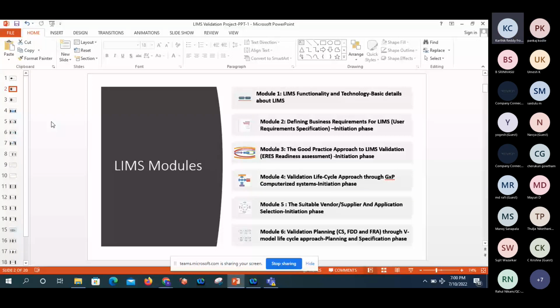A test protocol contains test scripts. In the test script, we state the steps, whatever the patches are, this is the description, this is the expected result, and this is pass or fail. If any issue happens, we maintain it through defect management.